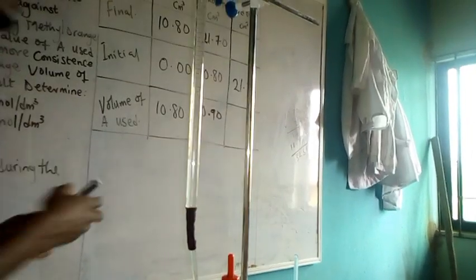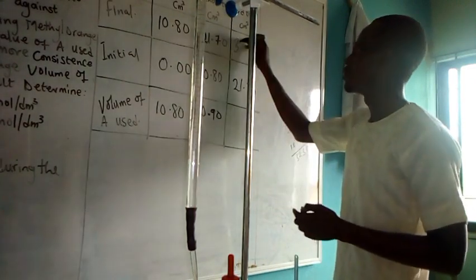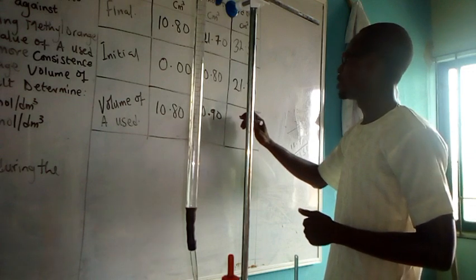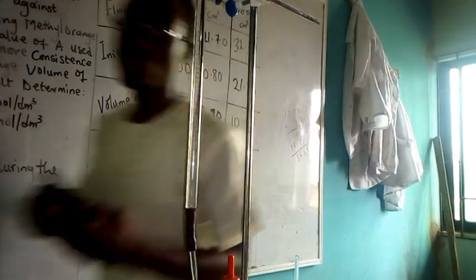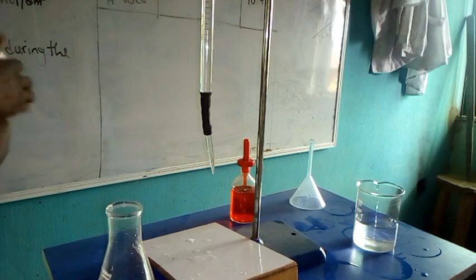32.3. Let's record that into the table. We have 32.30. So subtracting it from here, we would get 10.70. So 10.70 will be the next value. So we can go ahead with the numerical work that is left in order to find the solution to the question.